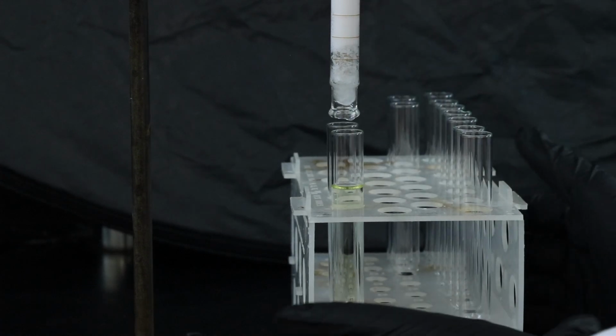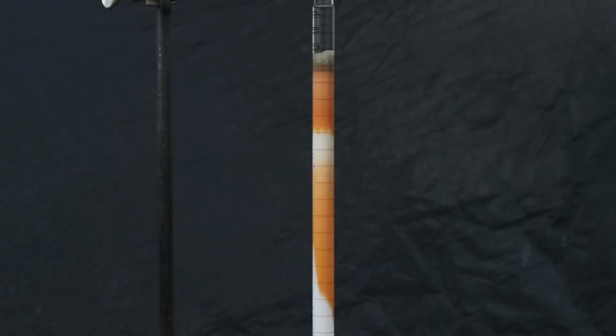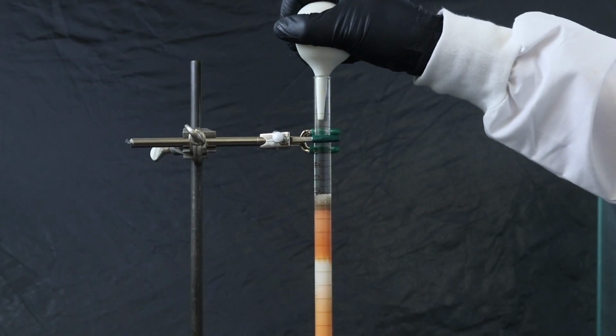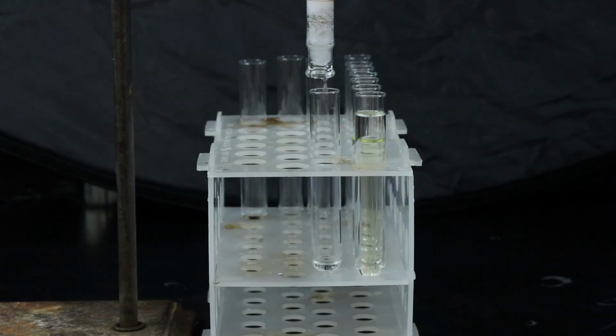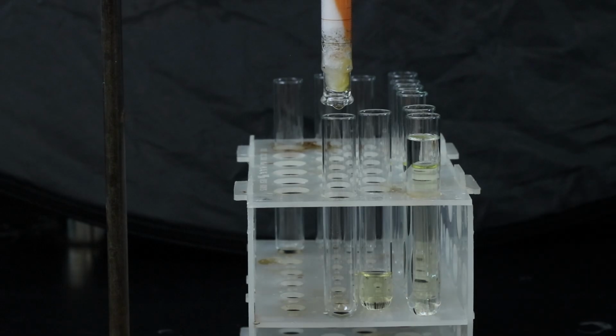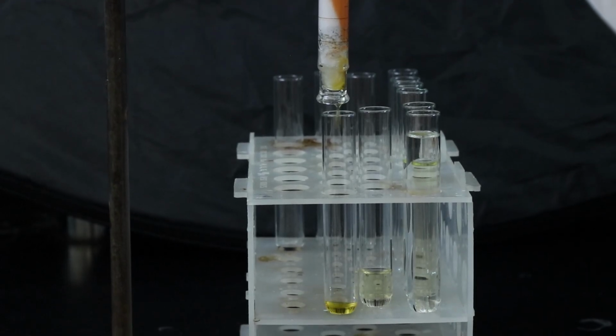As the test tubes fill up, I'll just place a new one under the column so that we can keep going. And now it looks like there's clear alumina between the two products, so we are ready to move on to the third solvent, which is the 9:1 methylene chloride hexane solution. I'll keep pushing the solvent through until we can see some orange come out, and from there I'm just going to be eluting the column until basically all of the monoproduct is completely out.